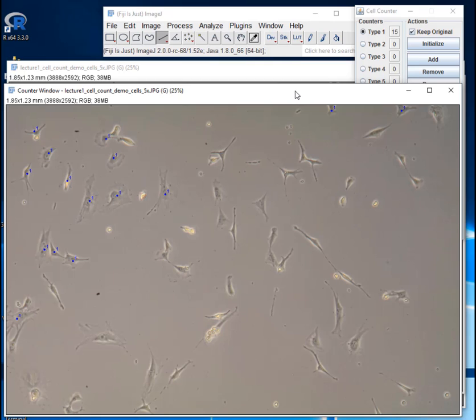One other thing I want to show you is you don't have to count all the cells in a picture, especially if you have a picture that has a lot of cells that are very confluent. That would be a pain to click on every single cell in the picture. Obviously the more area you count, the more accurate your count is going to be. But if you have a pretty uniform distribution, you can select a smaller area of your picture to count.